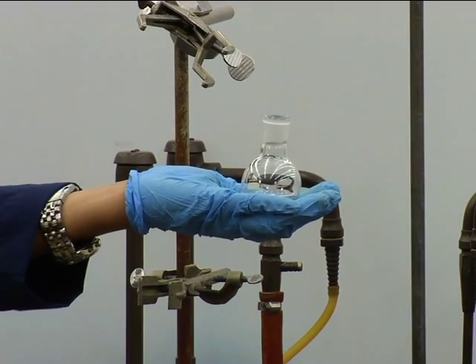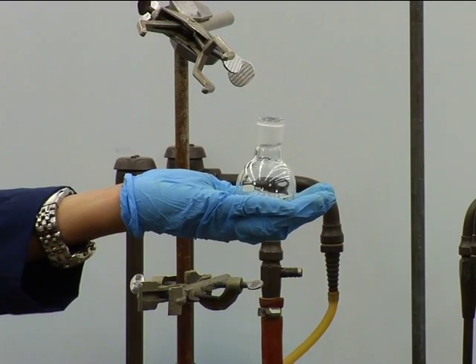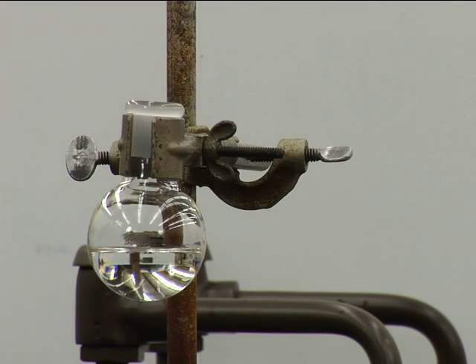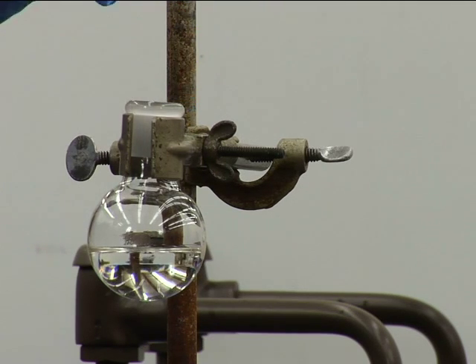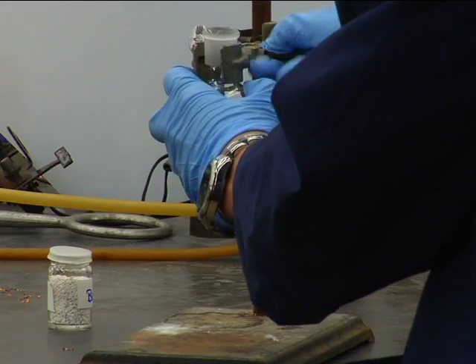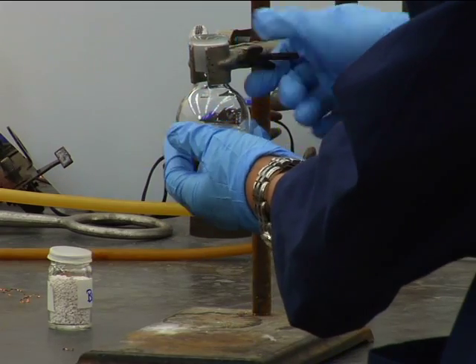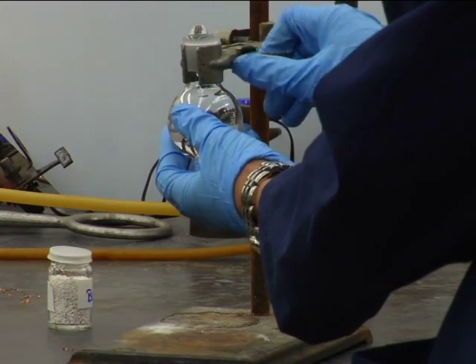Now we're ready to assemble the still. First, prepare a 50-50 ethyl acetate toluene solution in a 25 milliliter round bottom flask. Add 2 to 3 boiling chips gently. Note that your distilling pot should be no more than about two-thirds full at the beginning to allow room for frothing and boiling. Mount the round bottom flask on the ring stand about 6 inches above the desktop. Be sure that the ground glass joint of the flask is securely held by the clamp. This is the most important clamp in the apparatus because it's the one that holds up the still.